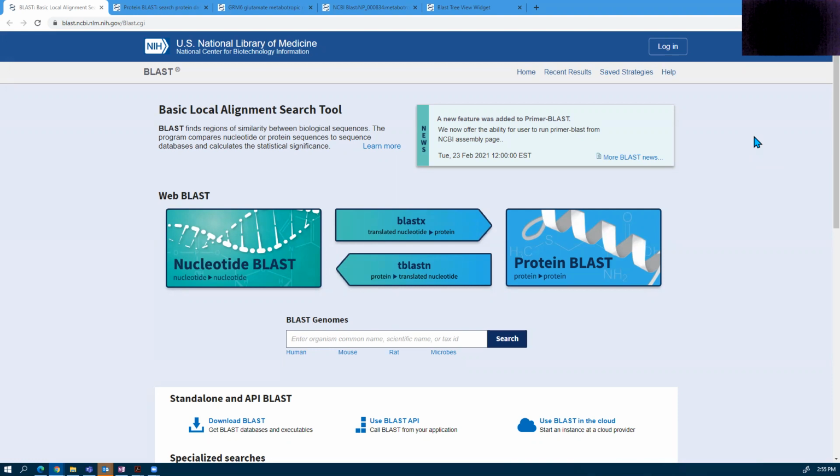I have three examples to show you today, starting from the most likely tree example that will apply for probably the majority of you in the class. And then I've got a couple of more unique examples that may apply to some of you as well. So follow along and let's make our trees.